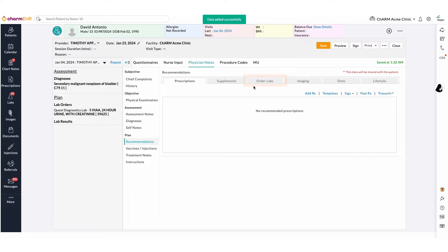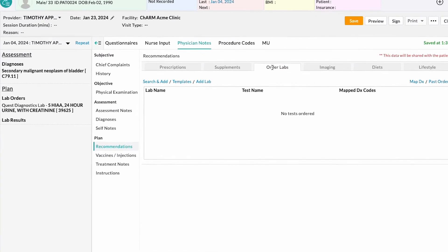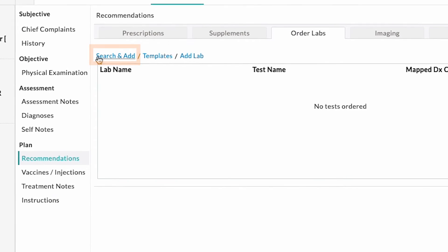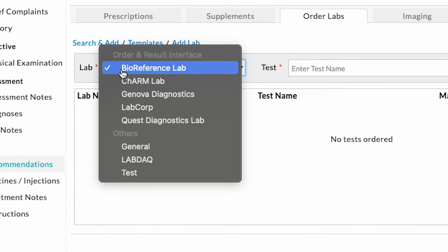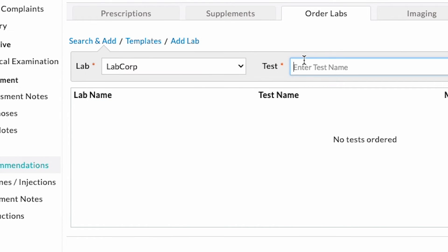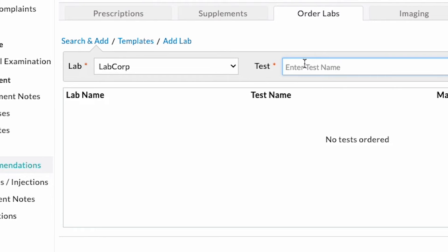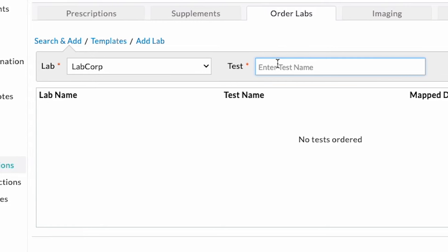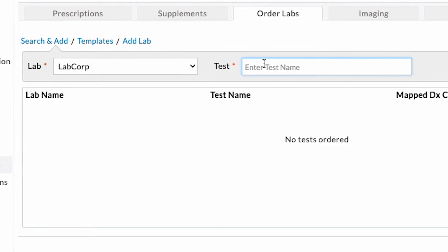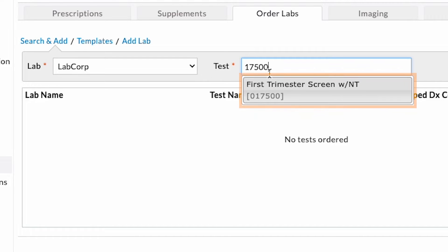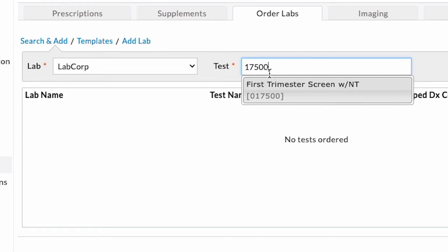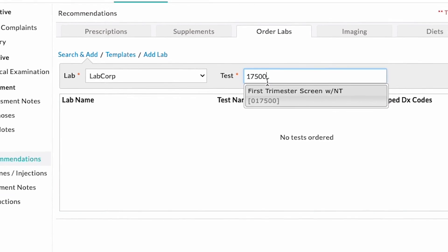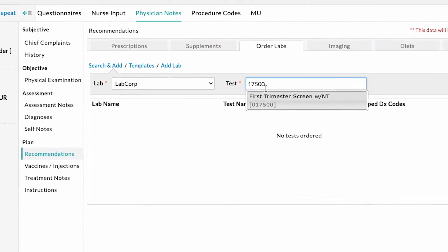To add labs, select the Search and Add option. Choose LabCorp from the drop-down menu. Since the interface is enabled with LabCorp, the complete test will show up in your account. Type out the test code or the first few characters of the test name you were looking for. Matching tests will be listed in the Auto-Suggestion drop-down.